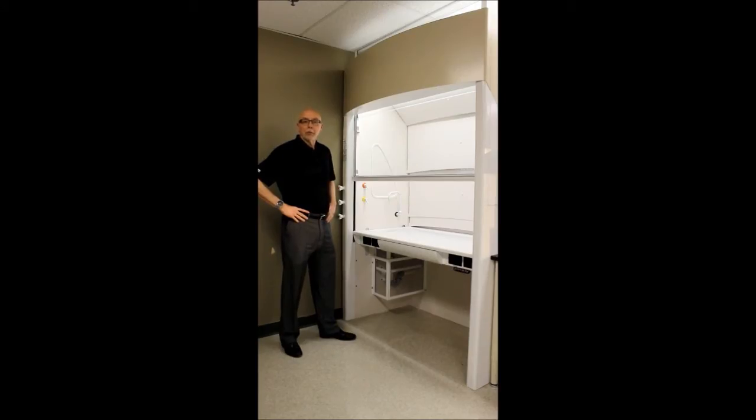Welcome to the Mott YouTube channel. This is Chip Diefendorf, Director of Business Development, and we'll be talking about the Optima fume hood.